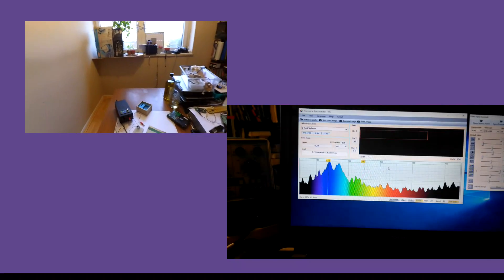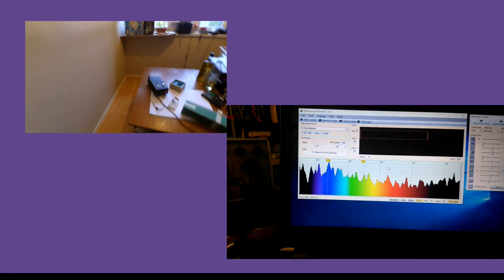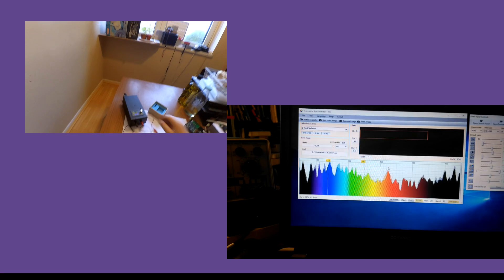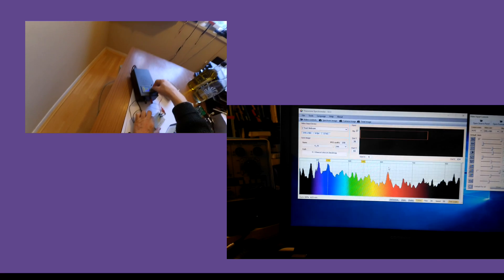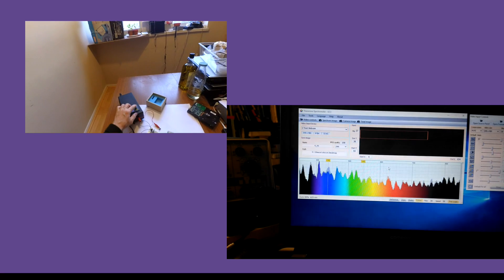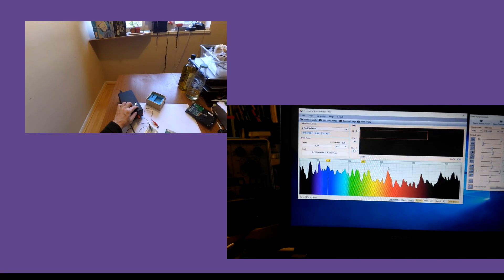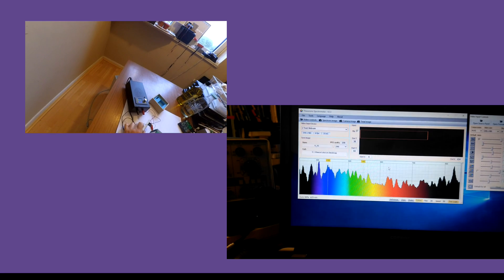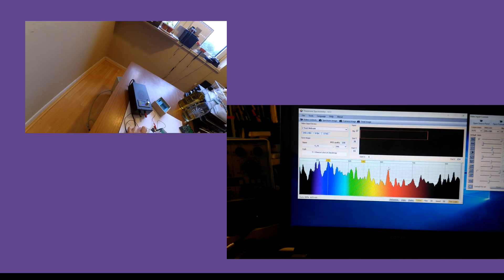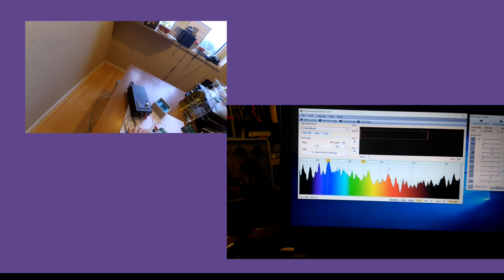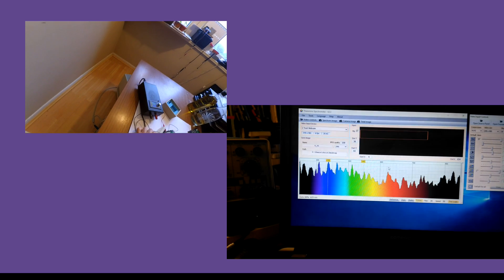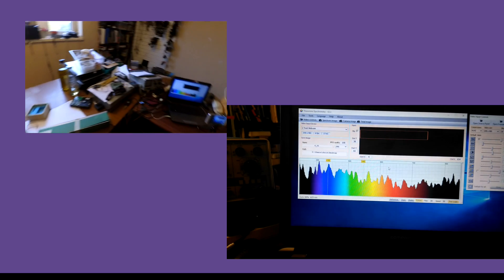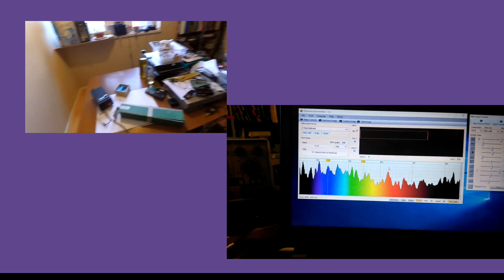And we can test that approximately anyway by using this laser, which is 650 nanometers nominally. It's a red laser, and they tend to be around there. They can be 637.